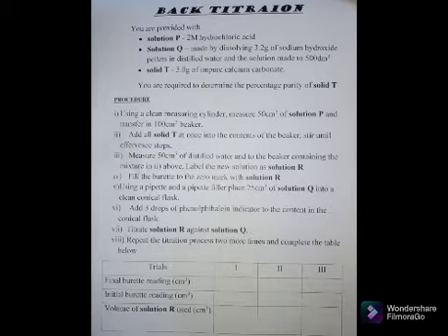You are told, using a clean measuring cylinder, measure 50 cubic centimeters of solution P and transfer it into another 100 cubic centimeter empty beaker. Then add all solid T at once to the content in the beaker and stir until the effervescence stops. Step number three, measure 50 cubic centimeters of distilled water and add it into the beaker containing the above mixture. That mixture, we label it solution R.